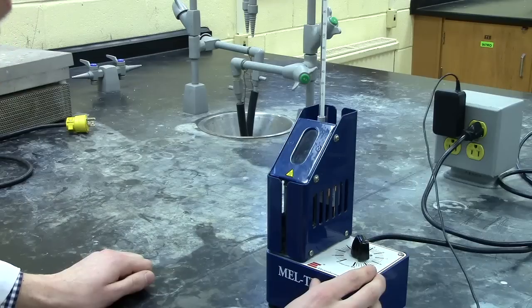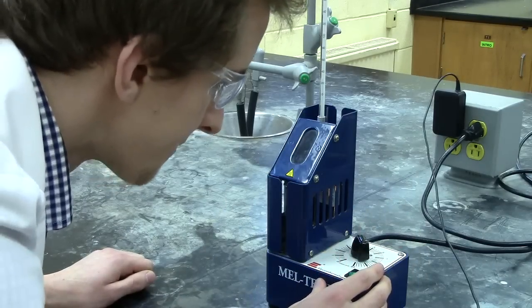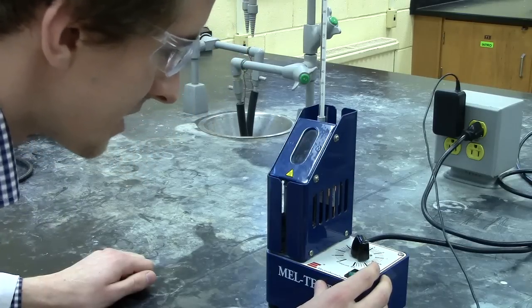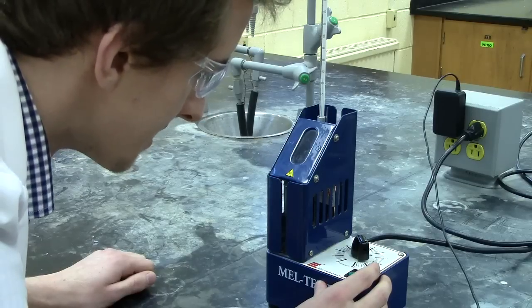Because you expect melt temperature to be within a range, you'll be looking for the first formation of a liquid as the first temperature that you record as your melt temperature range, and then the complete disappearance of a solid as the second temperature that you record within your range.